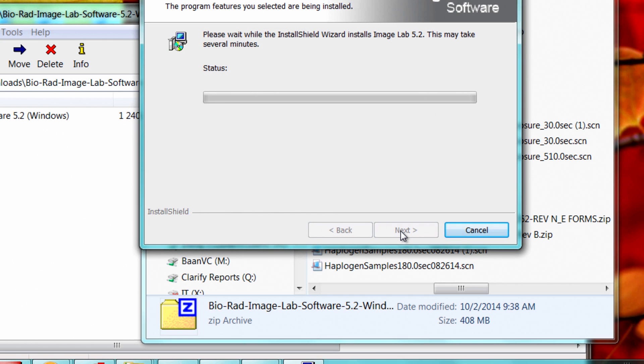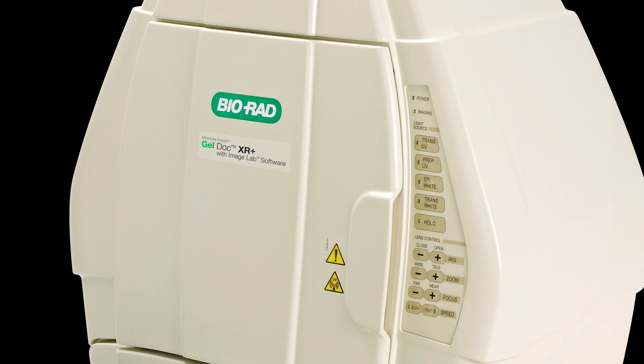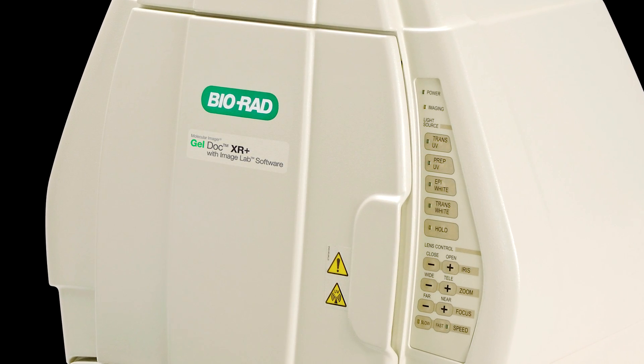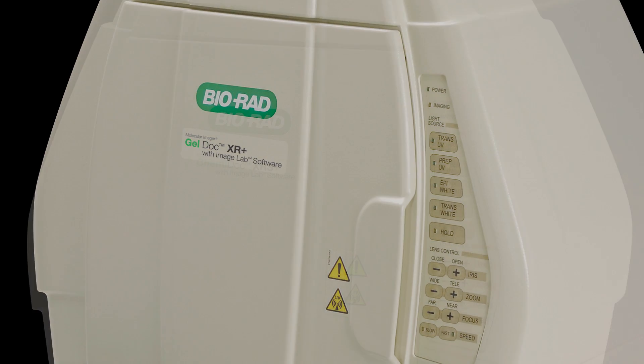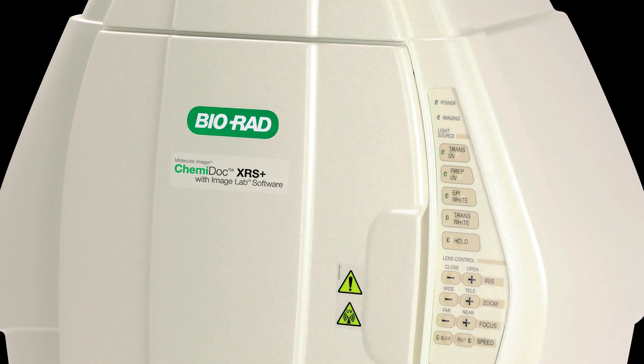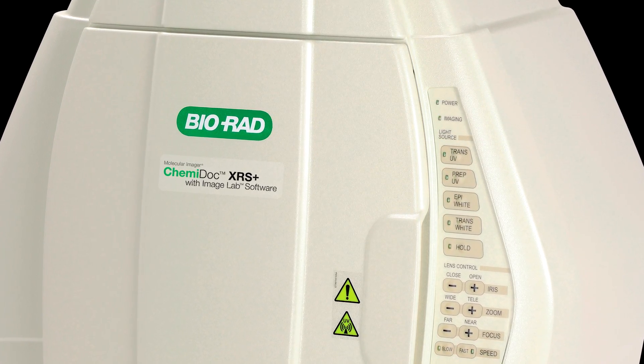If you have a GelDoc XR Plus system, your imager is now enabled for stain-free imaging and the following calibration steps are optional. If you have a Chemidoc XRS Plus system, you will need to perform a flat field calibration and bias value reset before enabling stain-free imaging.